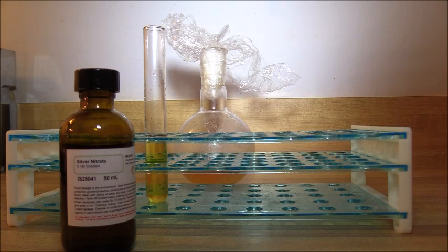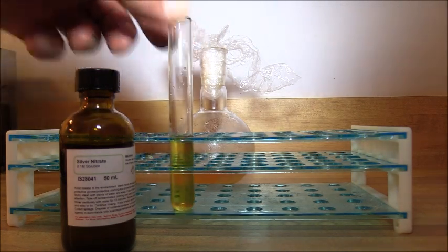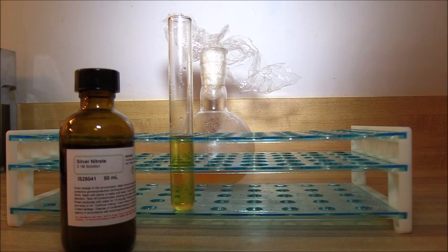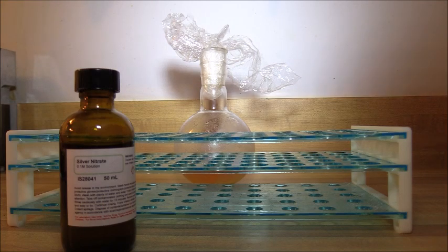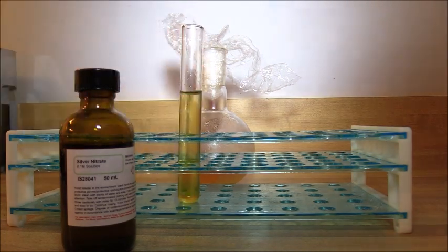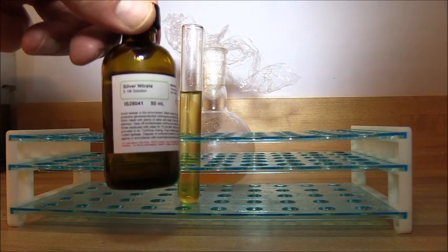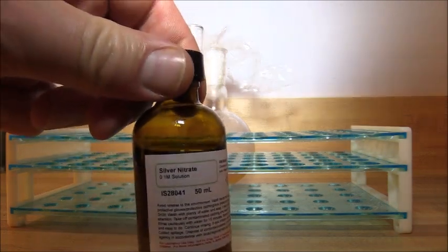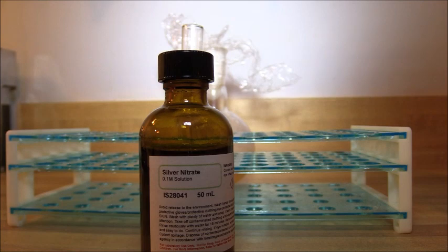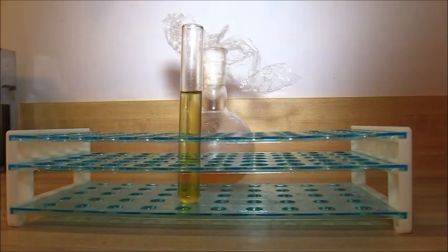As any good scientist would do, I'm going to show the experiment again and demonstrate that the solution does indeed produce a white precipitate when subjected to the same test. I've added some of the solution to a test tube, and now we're going to add some ammonia solution, followed by several drops of 0.1 molar silver nitrate.